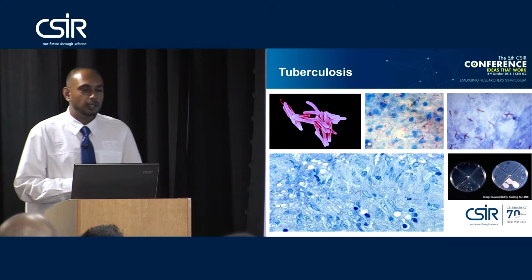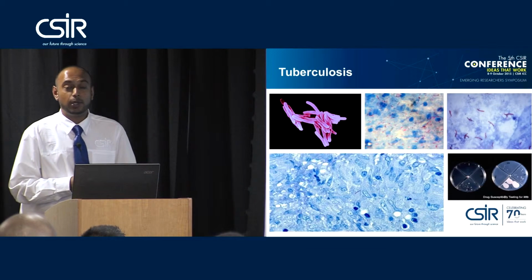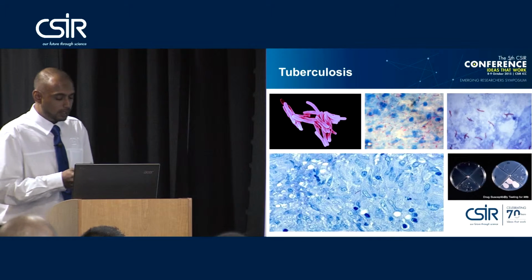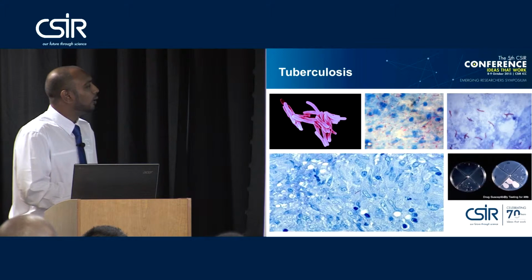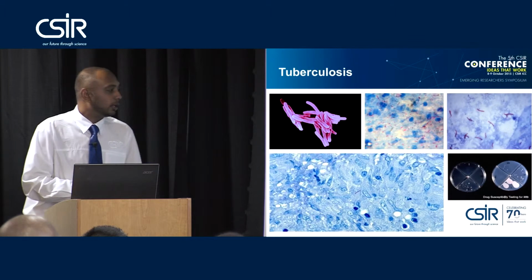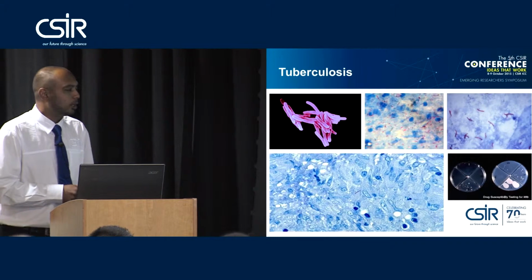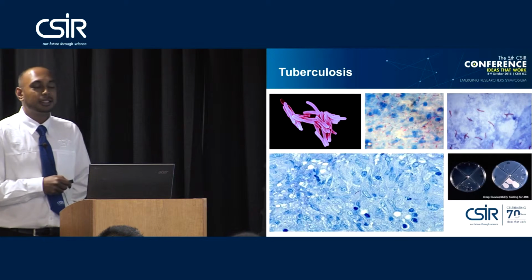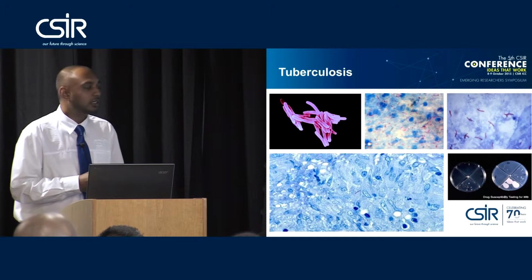And yes, we are looking at acid-fast stains here of submitted TB patient or potentially TB positive patients. Routinely in the tuberculosis laboratory, an acid-fast stain would be performed. We would see either numerous or moderate acid-fast bacilli, and we can even see scantily stained acid-fast bacilli. And based on 2 of 3 positively submitted specimens, the clinician or physician would diagnose the patient as having TB.